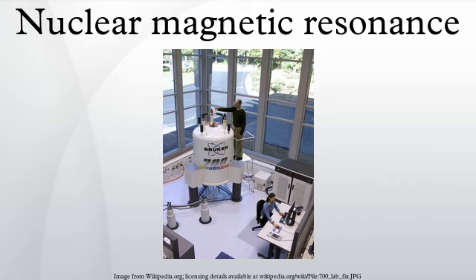Magnetic resonance by nuclei: resonant absorption by nuclear spins will occur only when electromagnetic radiation of the correct frequency is being applied to match the energy difference between the nuclear spin levels in a constant magnetic field of the appropriate strength. The energy of an absorbed photon is then E equals hν0, where ν0 is the resonance radio frequency that is to match.